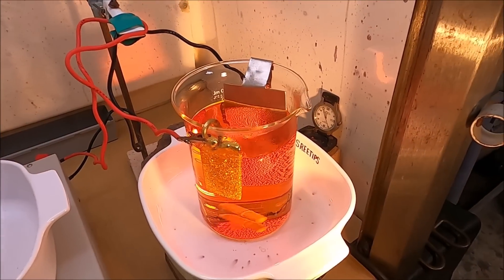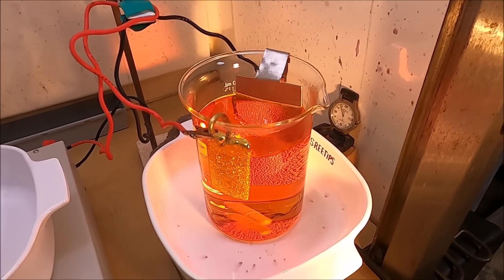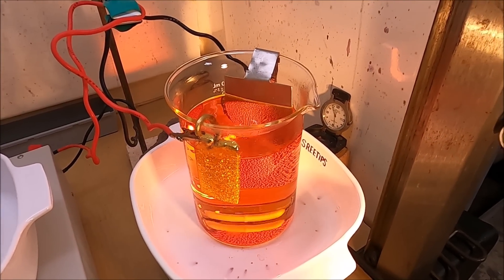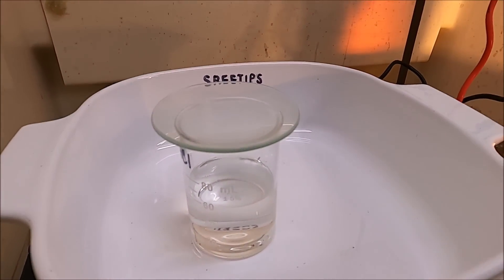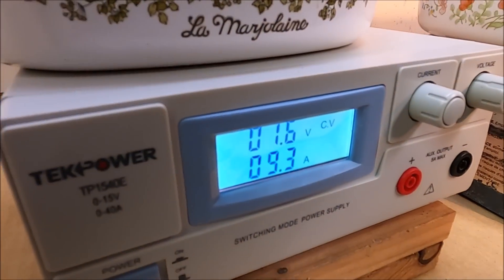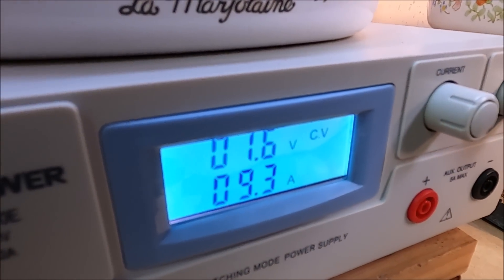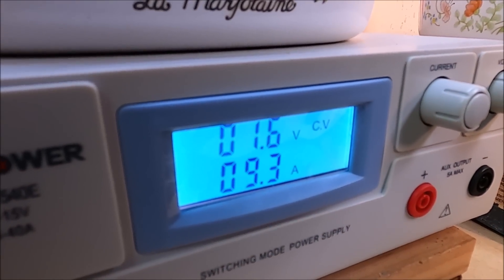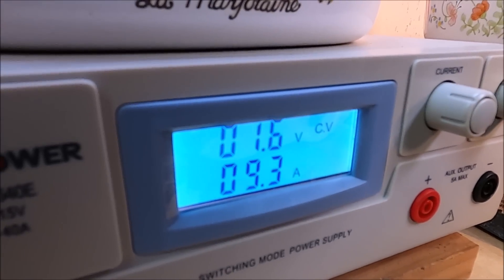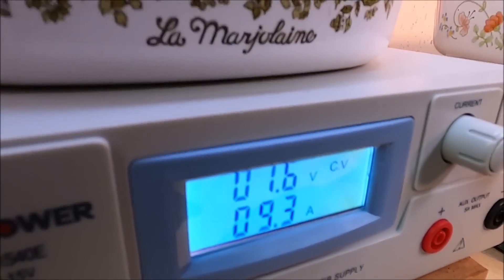It's been running for about an hour and a half, and it got dehydrated, so I added some hydrochloric acid. Now we've got the amp current flow up over 9 amps with the voltage at 1.6.